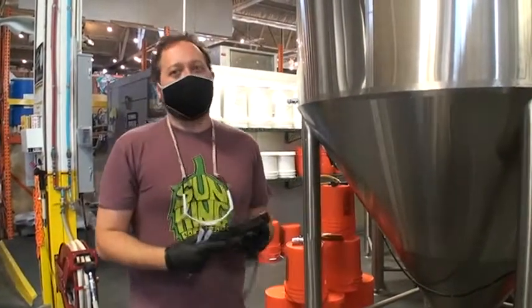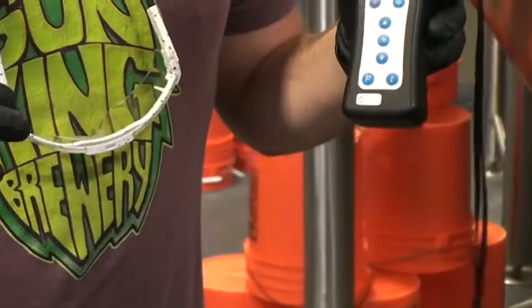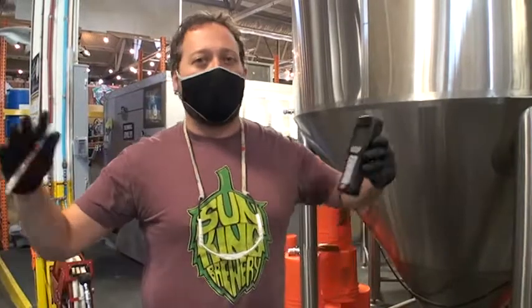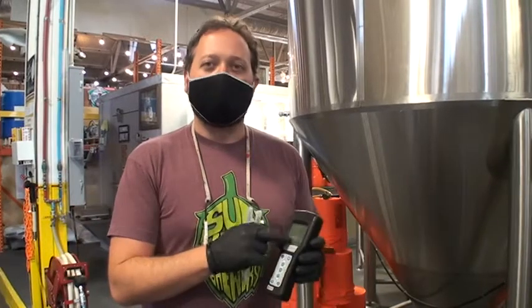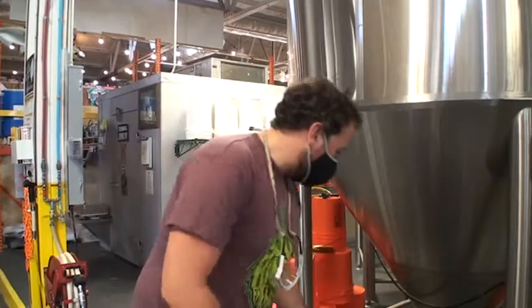Another great micro test. This is called an ATP luminometer. What it does, it measures ATP, which is the energy molecule found in all living organisms. So we're going to swab for anything that's in our environment. If it's living, this will tell us what's there in a relative concentration number.